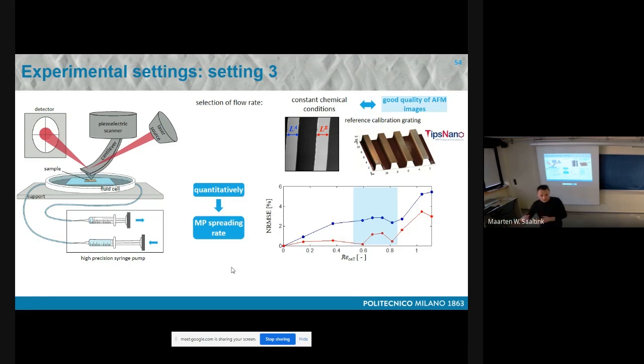So with Damian we applied geostatistical analysis of the topography, because with the vertical scanning interferometer that was the best we could do under the experimental conditions. The rate is the difference between two topographic surfaces, so the point is to combine the statistics of the topographic surface and from those come up with the statistics of the rates, which is not that easy. And this is what we are trying to develop right now.